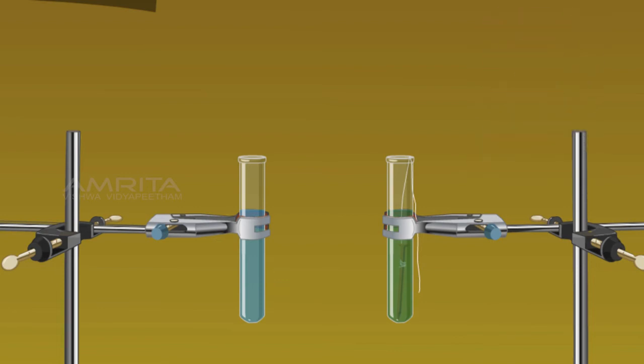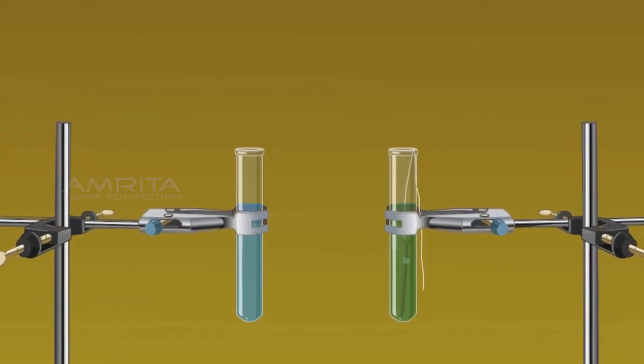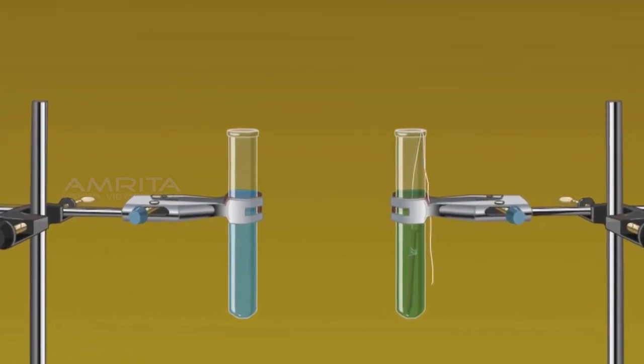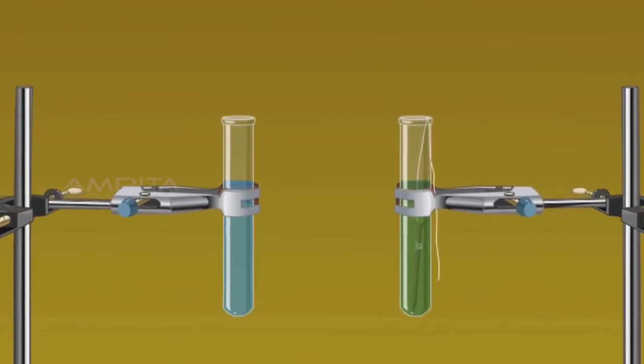After 15 minutes, the color of the copper sulphate solution containing the iron nail turns light greenish, whereas the color of the solution in the other test tube does not change. The greenish color of the solution is due to the presence of Fe2+ ions.